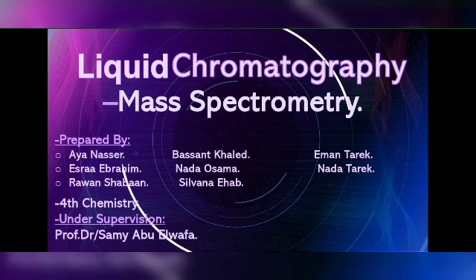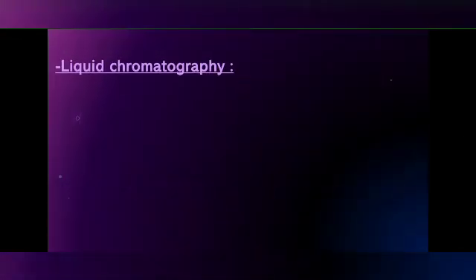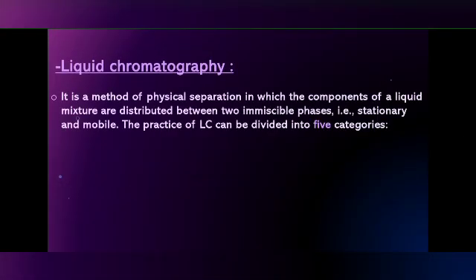Hello everyone, our topic for today is liquid chromatography mass spectrometry. Liquid chromatography is a method of physical separation in which the components of a liquid mixture are distributed between two immiscible phases, stationary and mobile.